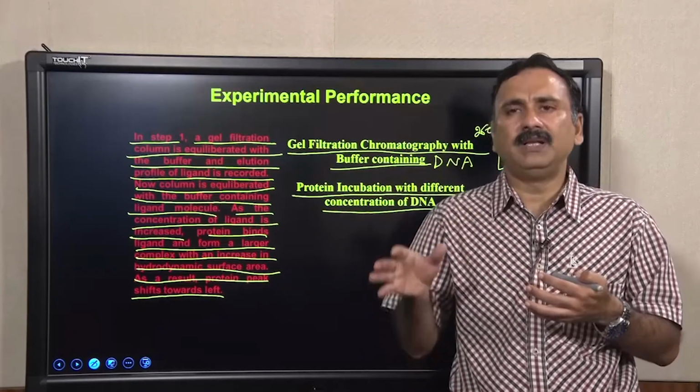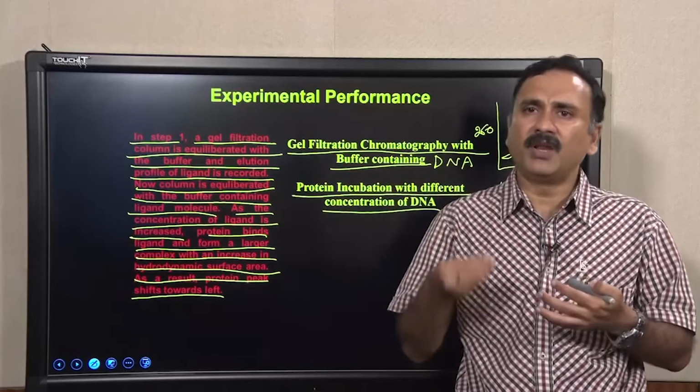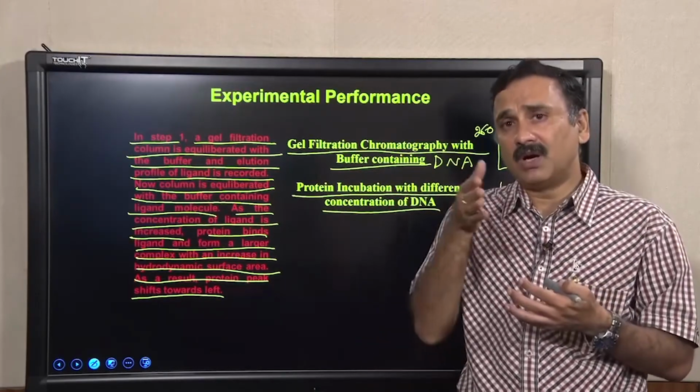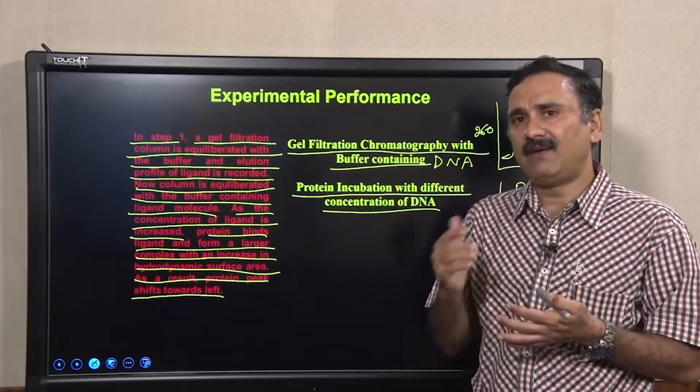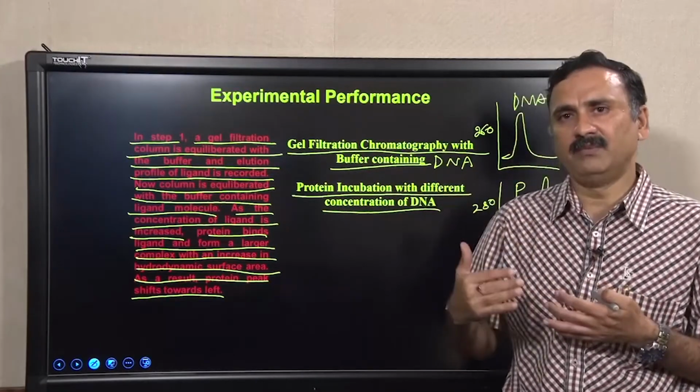So there is a possibility that the protein might interact with the DNA non-specifically as well. To confirm this, you have to do validation experiments.